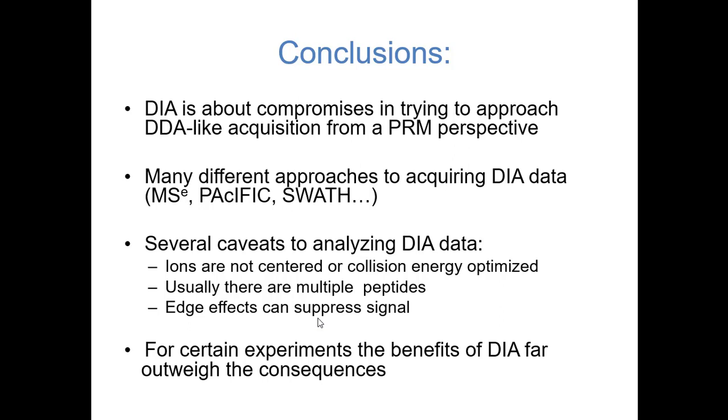SILAC, I think, is fundamentally limited in some ways because you basically doubled the precursor space. For every one of your peptides, you now have 2 precursor signals, so every peptide gets 2 chances at being detected, but at the same time you also have so much more that the instrument is kind of overwhelmed. And so it's much harder for it to actually sample everything.